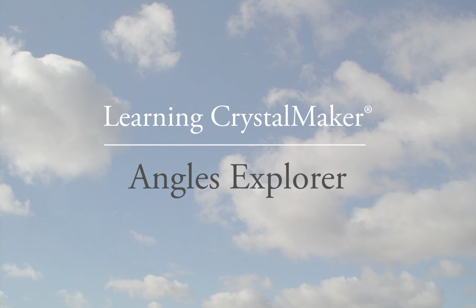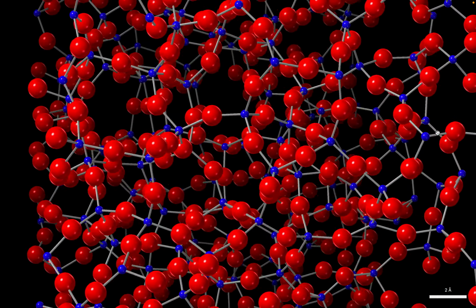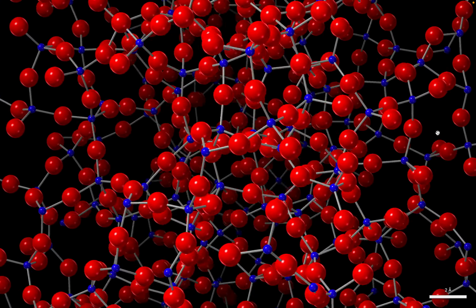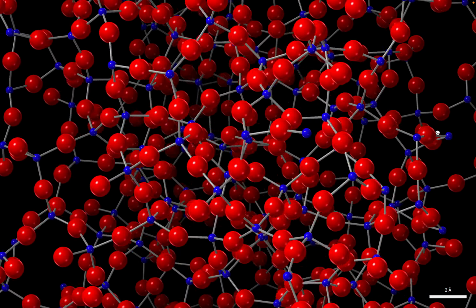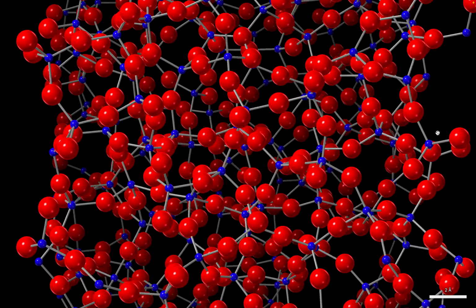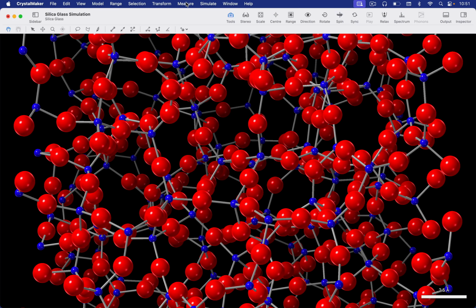Welcome to CrystalMaker 11. In this tutorial we'll explore the new Angles Explorer introduced in CrystalMaker 11.5. Now here we're looking at a model for amorphous silica, and we can see quite a disordered arrangement of atomic positions. We'd like to map the distributions of bond angles. To do this we'll use the new Angle Distributions command.